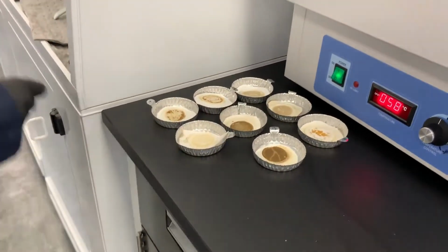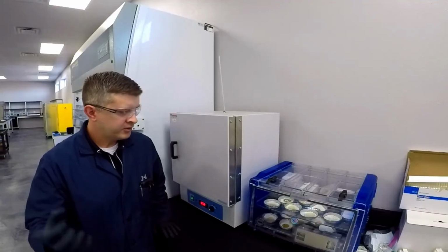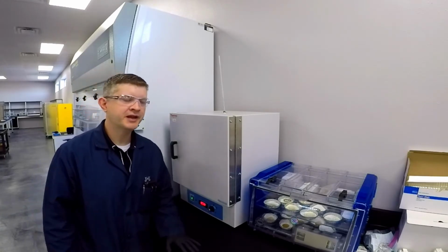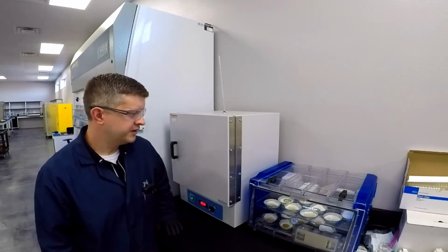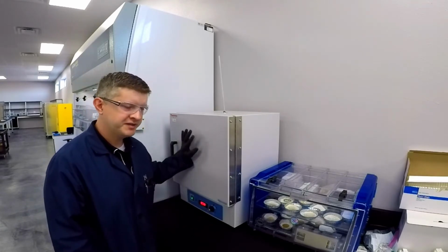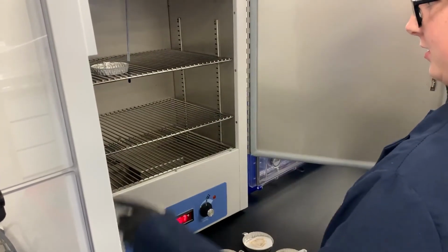So Eric, tell us about the drying and weighing process. How does all that work? What are we looking at here? So we're running solutions through the Millipores, and that's solubilizing the components that are soluble in whatever solution we're pouring through. So then we need to be able to dry it to get the residual solutions off. To help with that process, we're going to put it in our oven here. We'll dry it off for a certain amount of time.